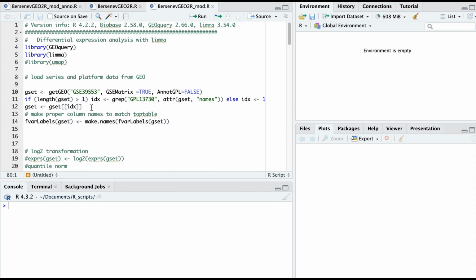The modifications which I did were good enough to have a differential expression table, but it had no gene names as we used to, and therefore I did a further modification in the third version of the script, which has this part on how to get those names and how to add them to your table. Let's go briefly through the script.